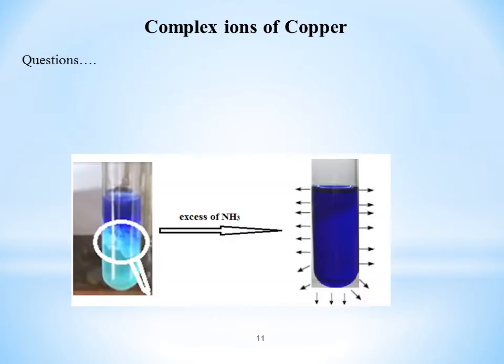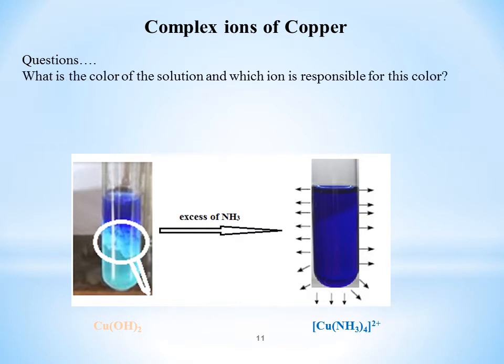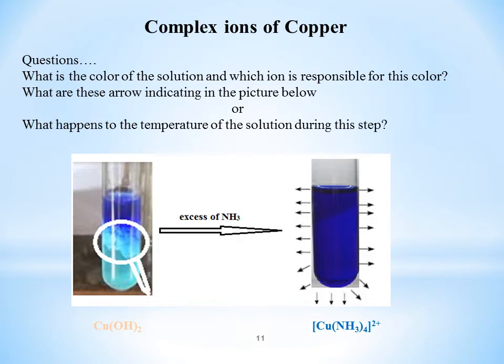Now, after observing the video and having a look at the chemical equations, you can answer the question: what is the color of the solution, and which ion is responsible for this color? What is the meaning of these arrows in this picture below?